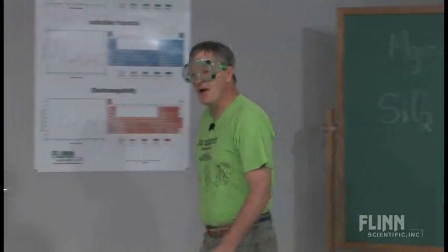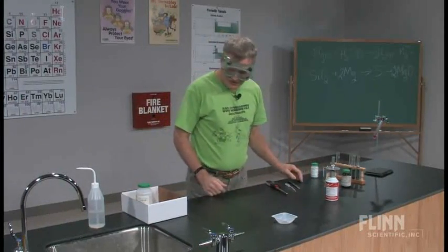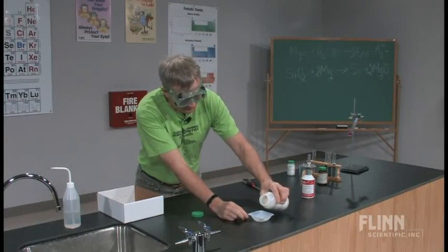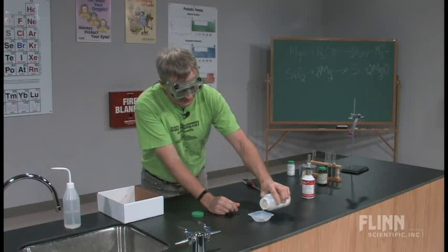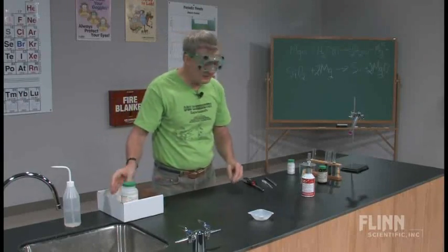All right, so let's go back. So now I'm going to take some sand, silicon dioxide, as you can see, sand, dump it in. This is really nice sea sand. I mean, this is great stuff. It's clean and granules are all the same size. There aren't any little rocks in it or dead fish or anything.